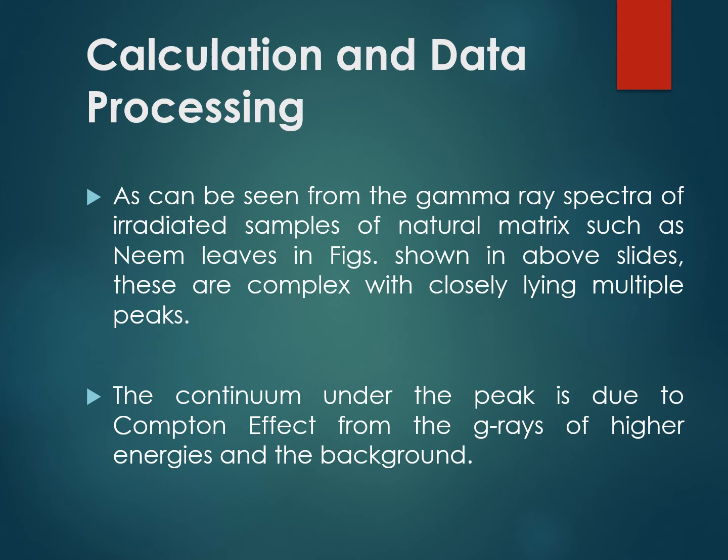So these regions sometimes collapse with the other region, and it makes difficulty in interpretation of different results having multiple peaks.